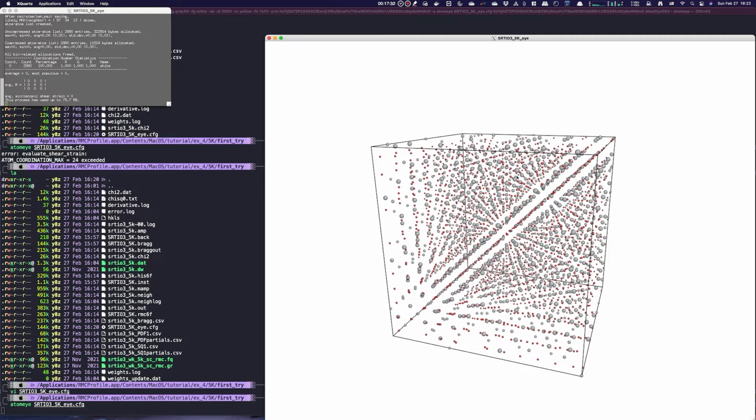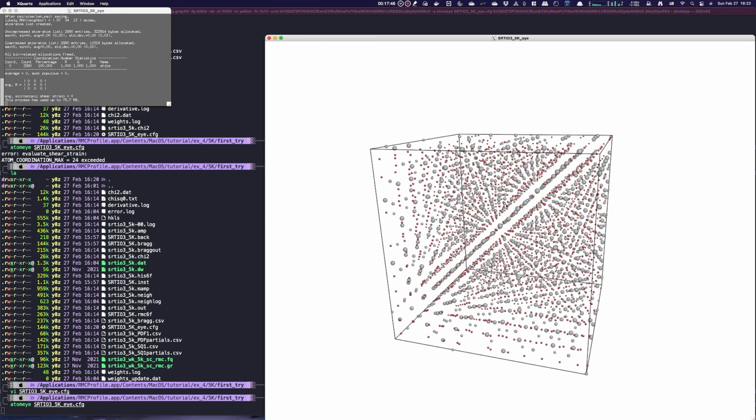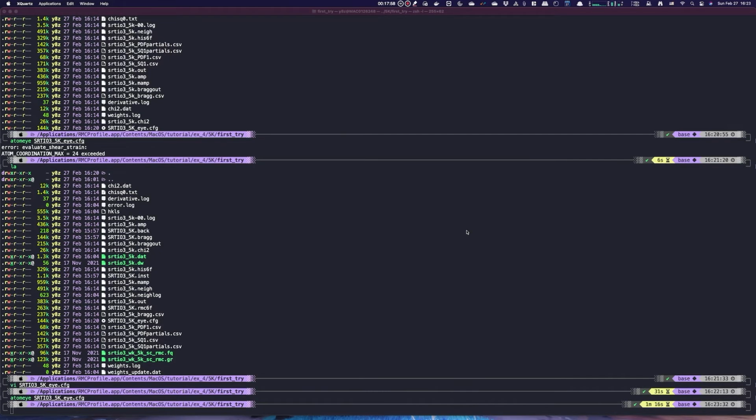But anyhow, supposing the distance is somehow right, we can just press the B button, and a whole bunch of other things you can check out from the Atomeye website about how to manipulate the structural configuration to see something useful for you, or just plot the configuration for putting into documentation or something like that. Once you are done with the visualization, you can press the Q button on the keyboard to exit the program. So that's about the visualization of the structural configuration.